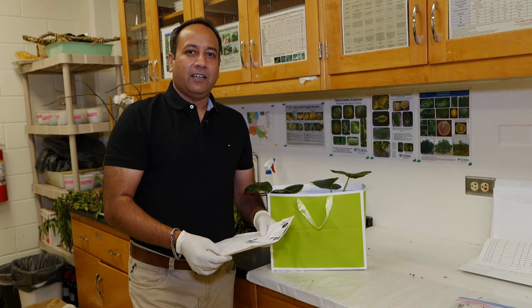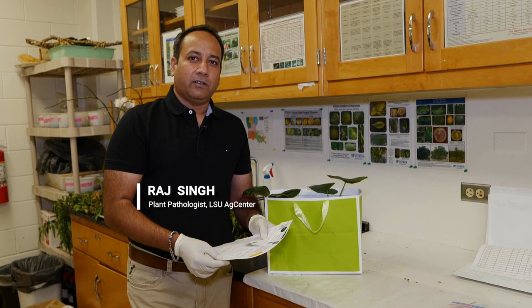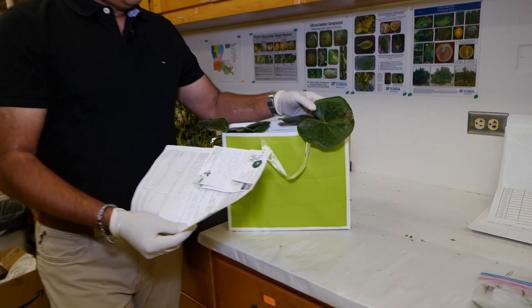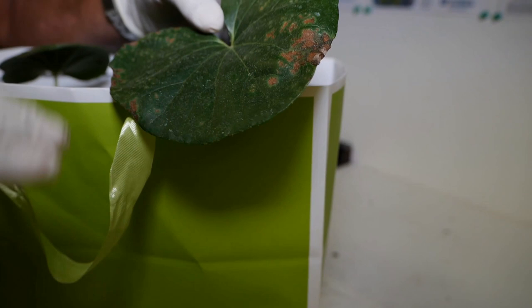Hi, I'm Raj Singh. I work with LSU AG Center and I'm director of the Plant Diagnostic Center and extension plant pathologist for horticulture crops. We received a sample from a nursery here in Rapids Parish, and this unique plant is called ligularia. You can see on the leaves they are worried about these symptoms over here.